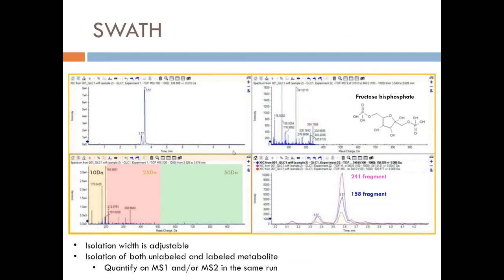And this allows you to finally start digging into things that you don't know, because you can use those fragmentation patterns to make connections between other potential known metabolites and to start building a set of unknown fragmentation patterns and build a new structure, or confirm those that are present that are already known.